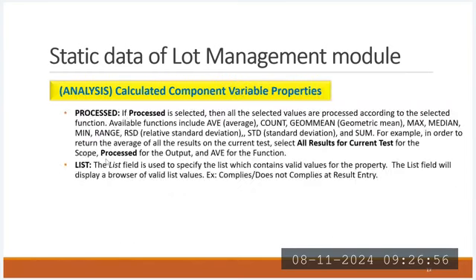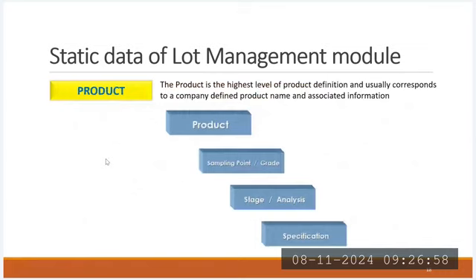And apart from this, once I finish the analysis preparation, when I am going with product preparation, there are some steps. First, I have to prepare the product. Under product, there are sampling point and grades, stage and analysis, and specification. This is the workflow of the product preparation.